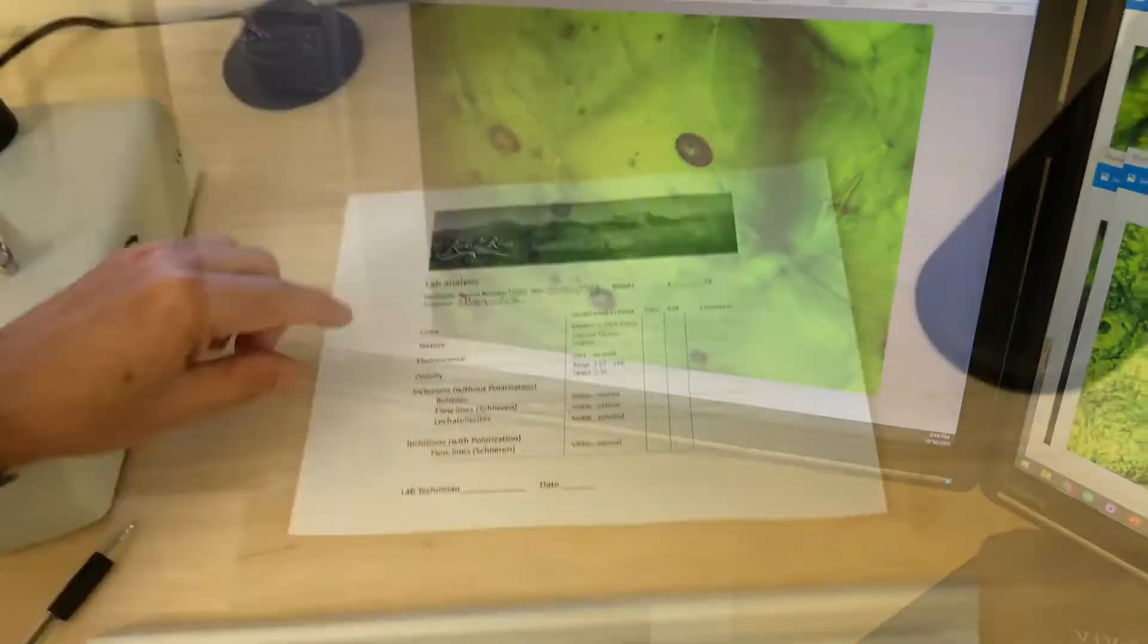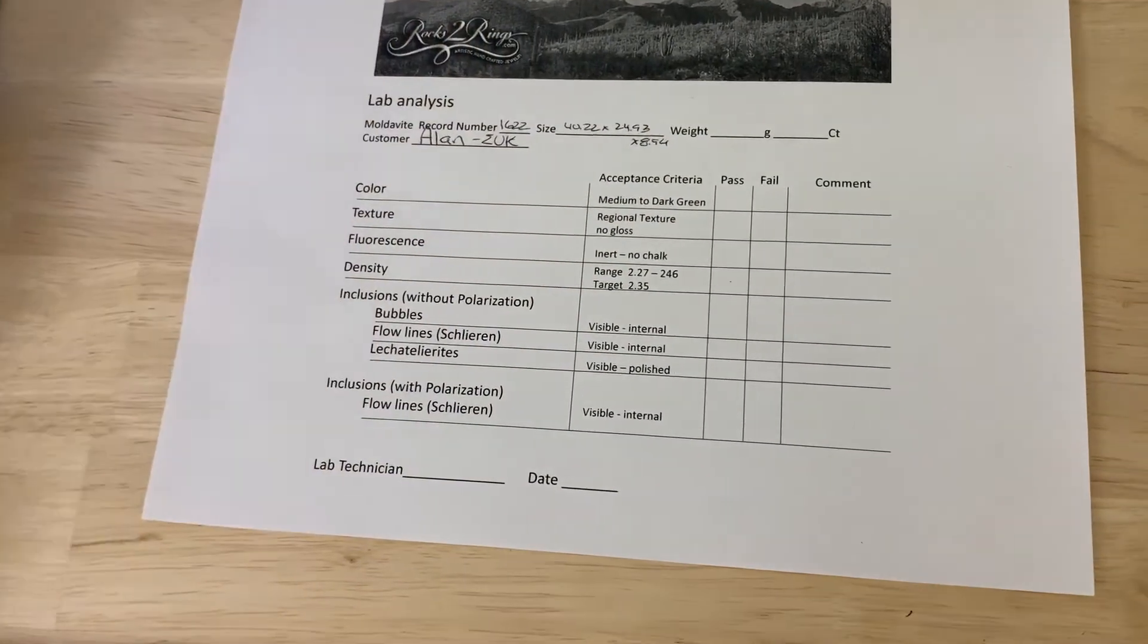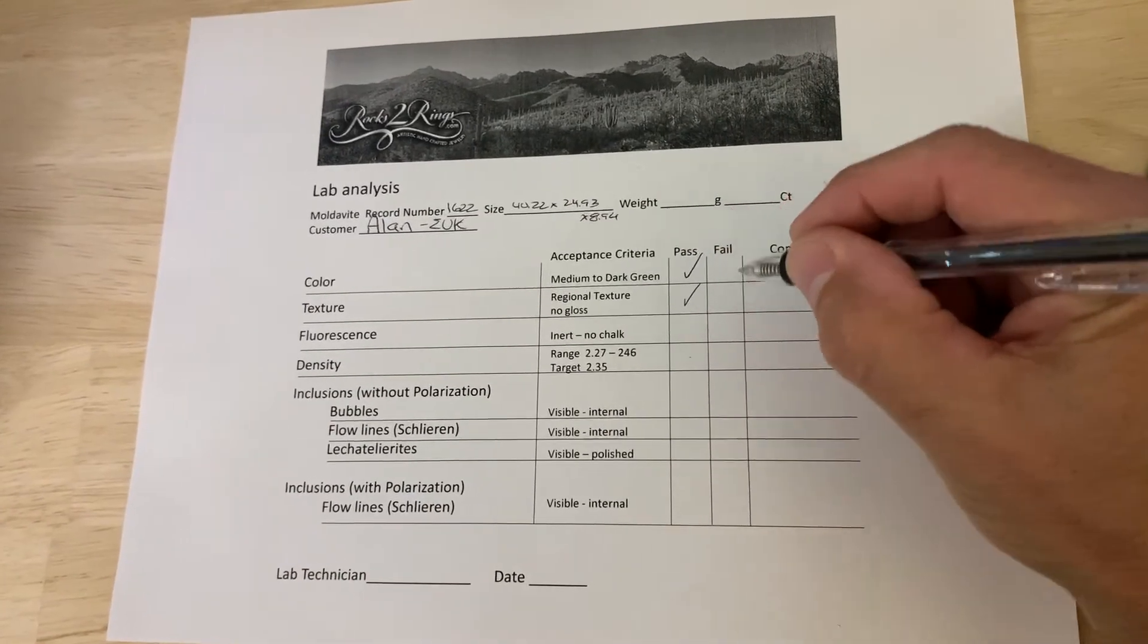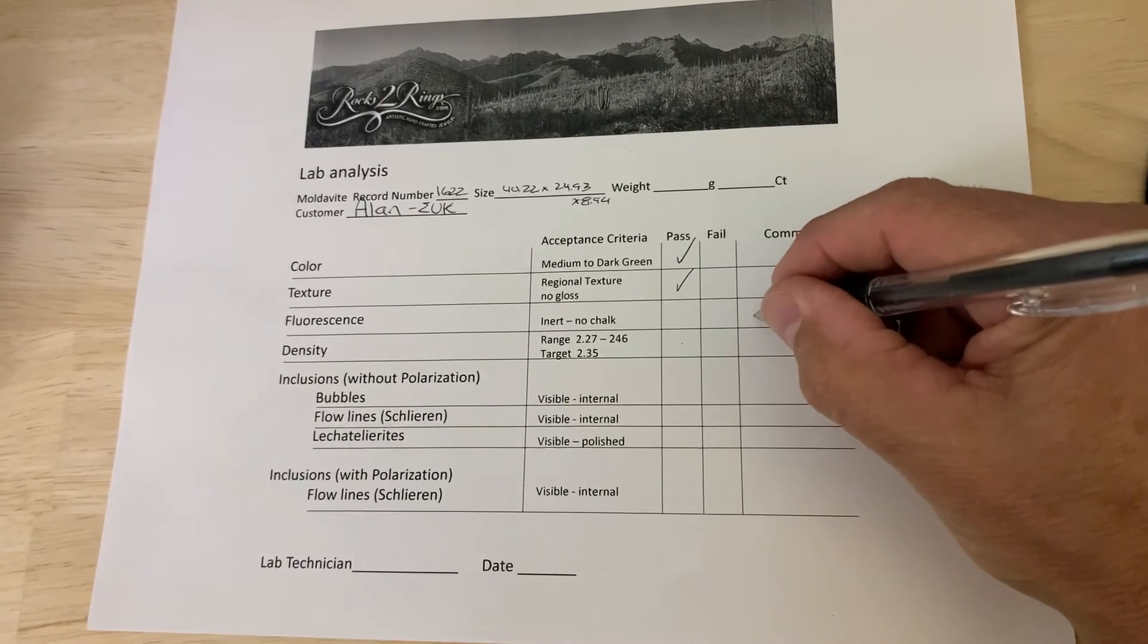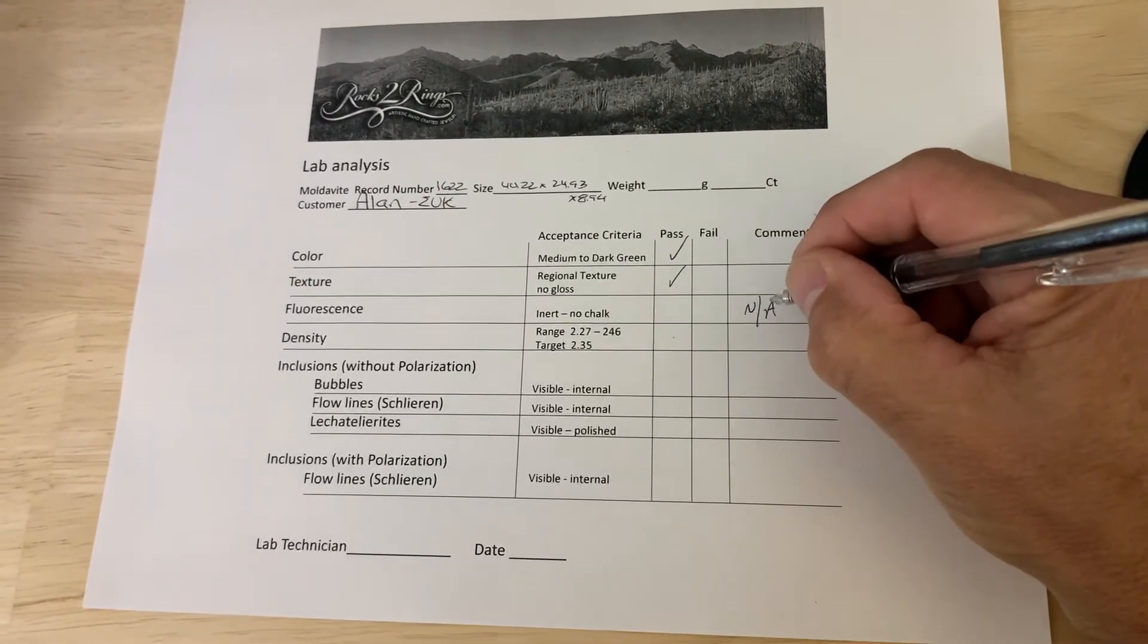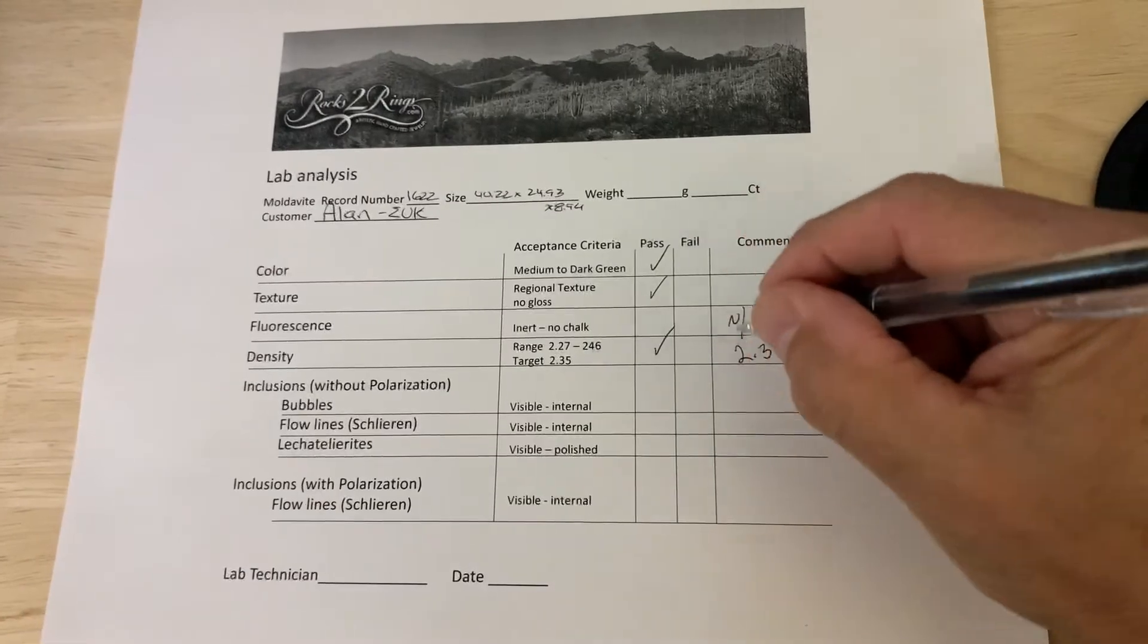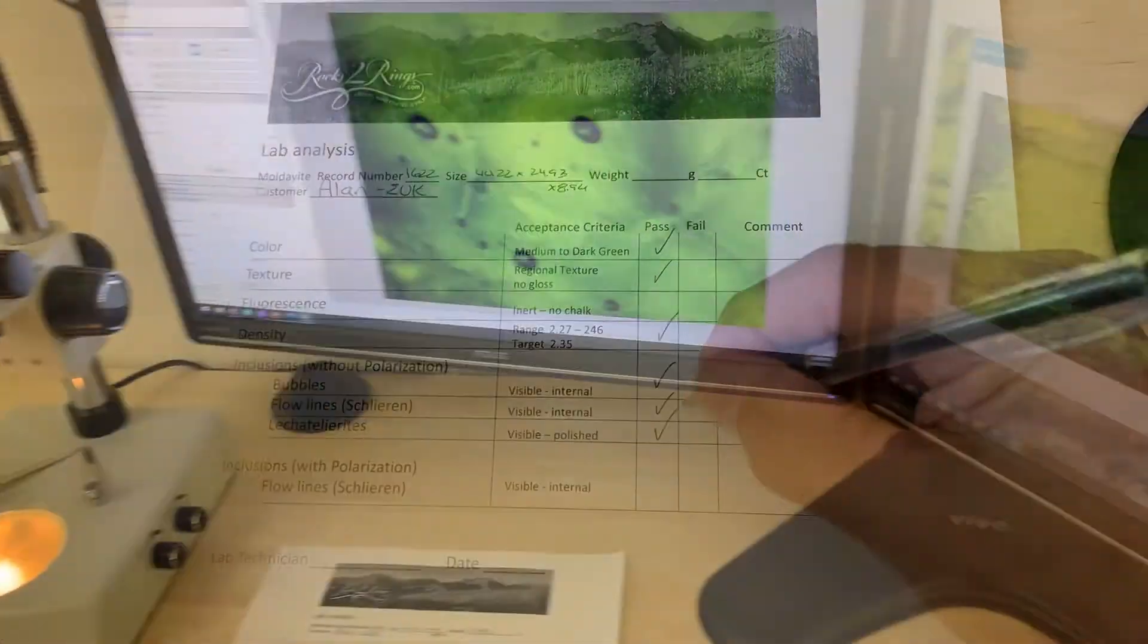Let's walk through it. We checked color—it was medium to dark green, that's a pass. We checked texture, and it is a southern Bohemian texture. We did not check fluorescence—you need to do that before you get it wet. We checked density and we were at 2.37, that's a pass. And we checked for bubbles, flow lines, and wigglies—they're all present.